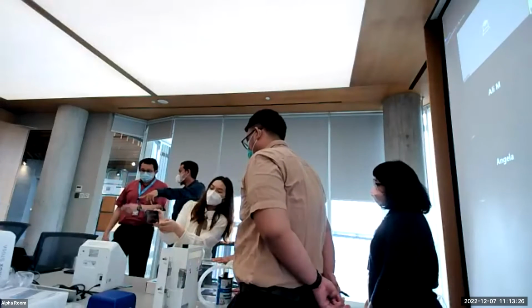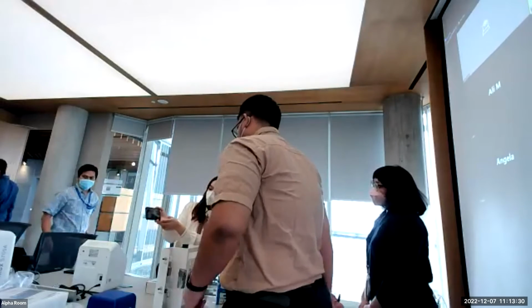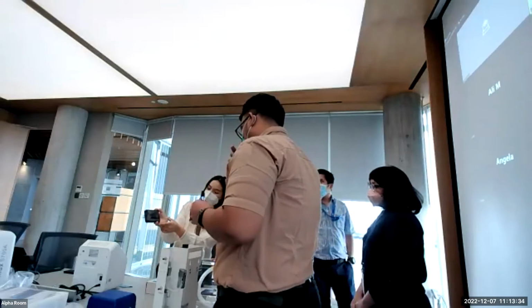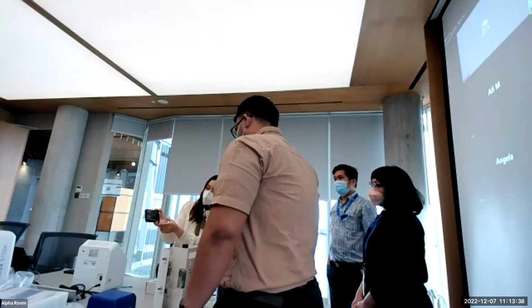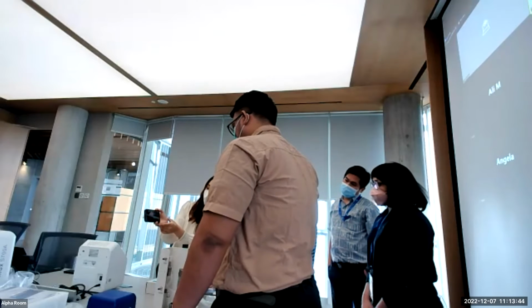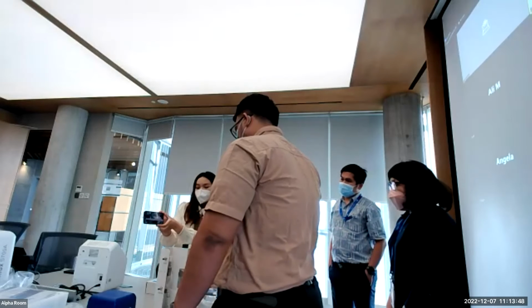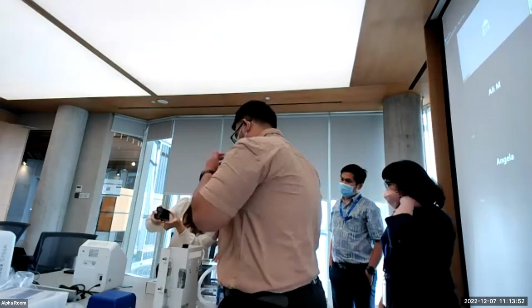Then they will get into one through a device in my PowerPoint. It's like a black one that can put the 5 tubes into one. In my PowerPoint, I just show the device. Chloe can introduce the device to you, because we don't put the device in our show.